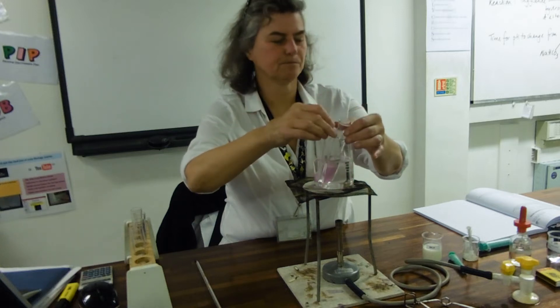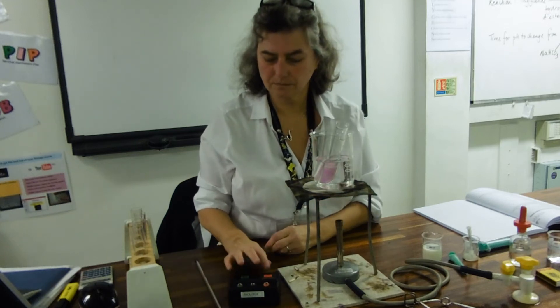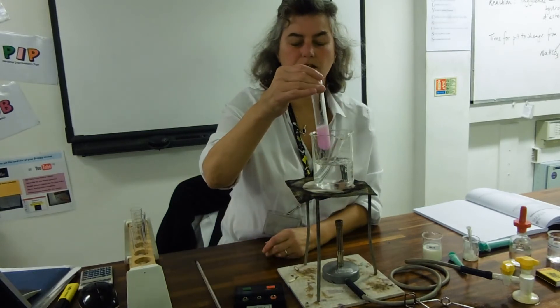Pouring them in and starting the stopwatch. And then we can see it getting colourless.